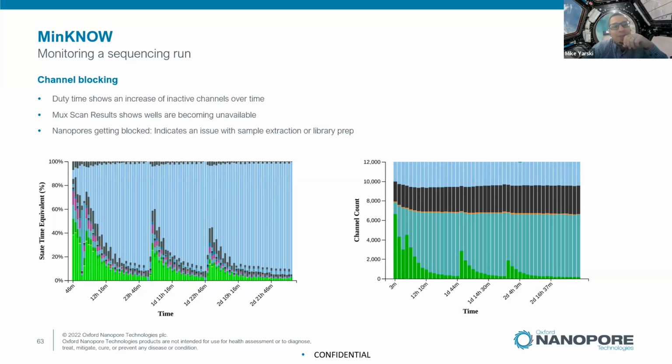The other one to point out is that if you've got a blocky sample, and I'm sure Annabelle and Nikki will share this with you, this is a macadamia tree. As one customer joked, this was one tough nut to crack. The carbohydrates and polysaccharides in the DNA will block the pores. The flow cell is running perfectly fine over here on the right, looking at the pore scans. So it's something you need to work on with Nikki, myself, Annabelle, and also go to the community and look at the extraction and see what people have done to get rid of these polysaccharides.